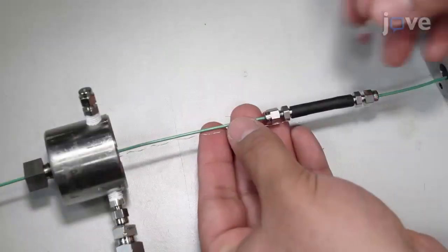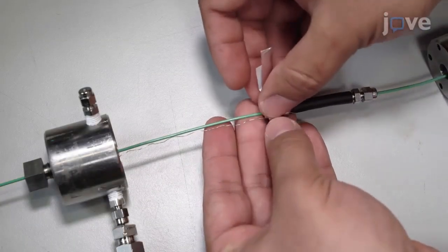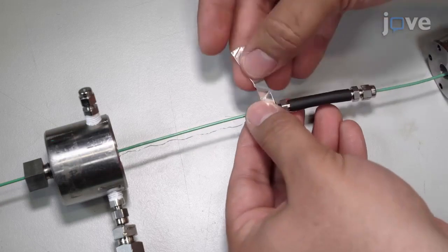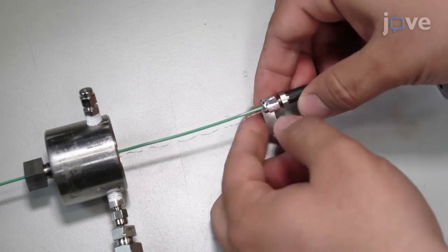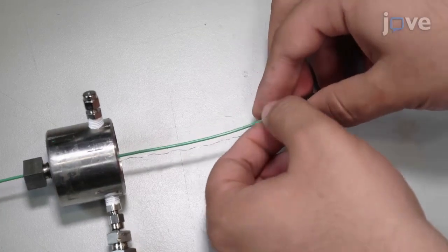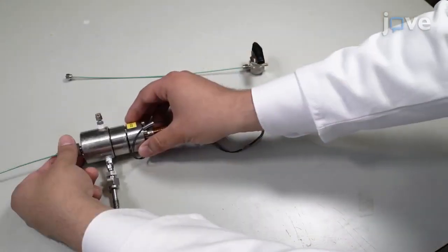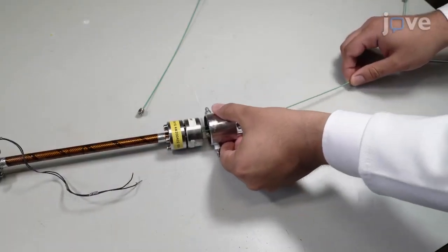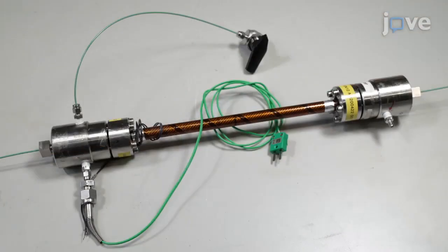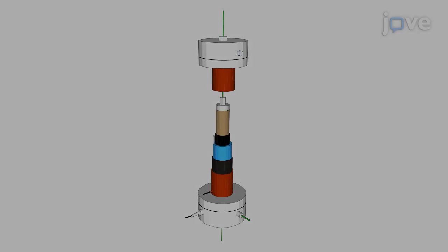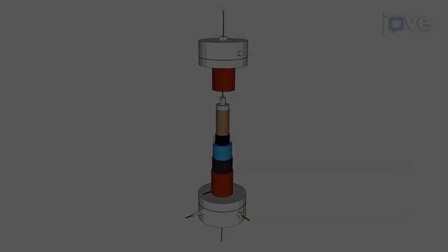Now, place a thermocouple on the base end piece with its tip next to the sample's base. Secure it with aluminum tape. Carefully complete the assembly of the core holder. This core holder assembly is ready for use in the protocol. This schematic provides details of its construction, shown in cutaway.